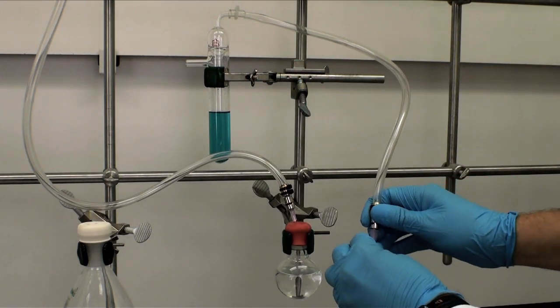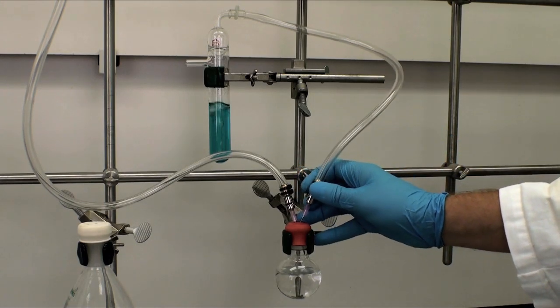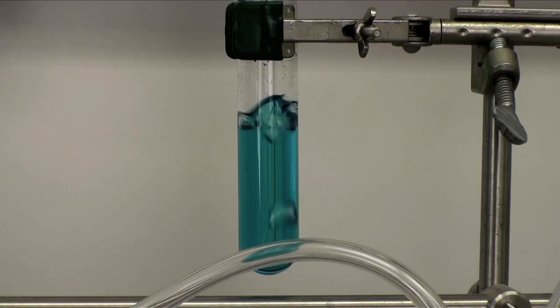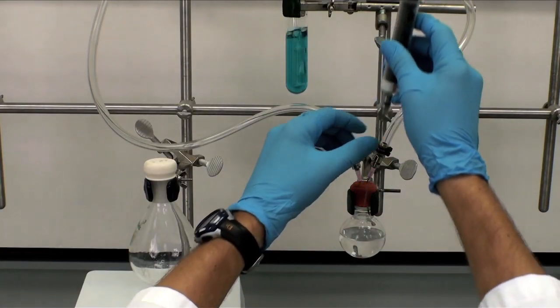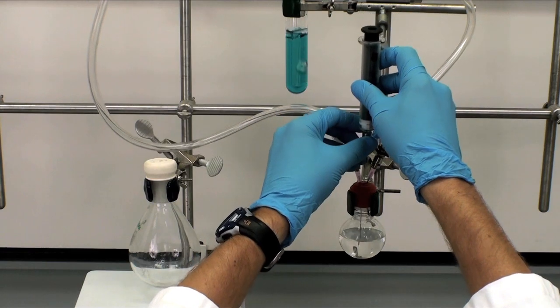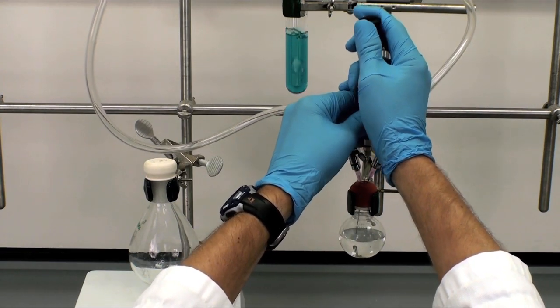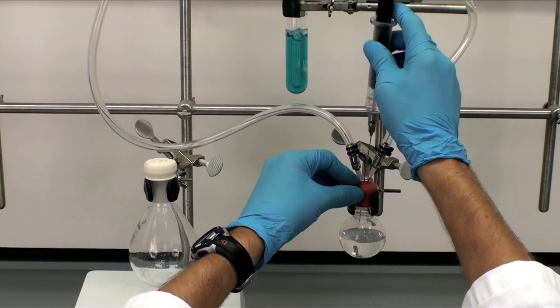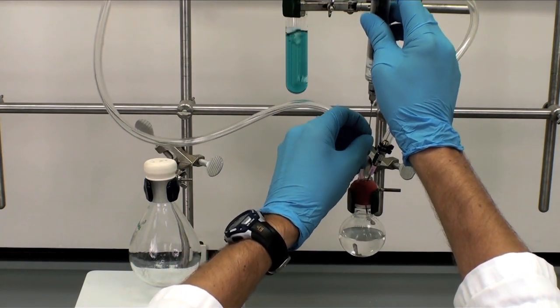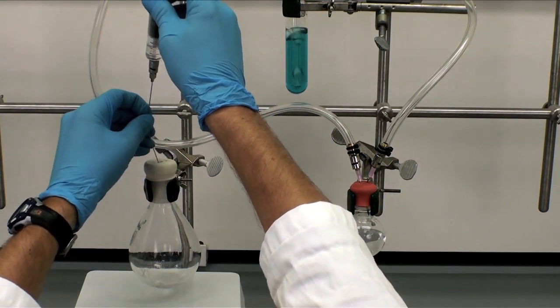To prevent overpressurization, you need to connect an outlet to a bubbler. Now, when I remove the syringe, I make sure that my other hand is holding the needle to point away from myself.